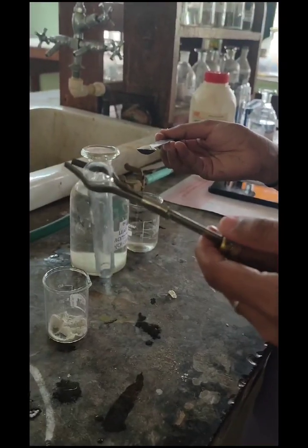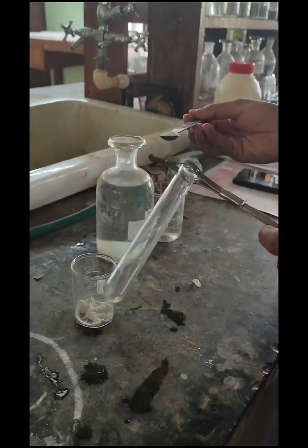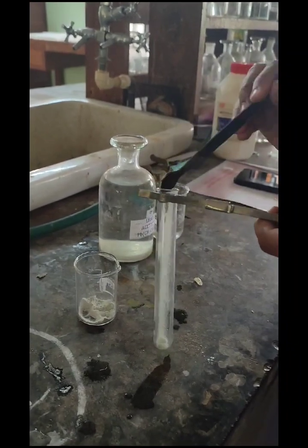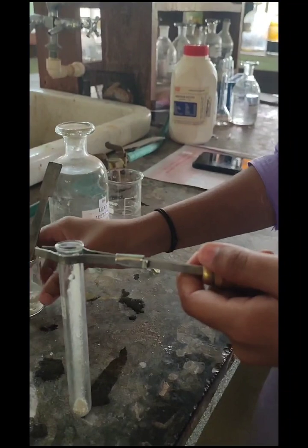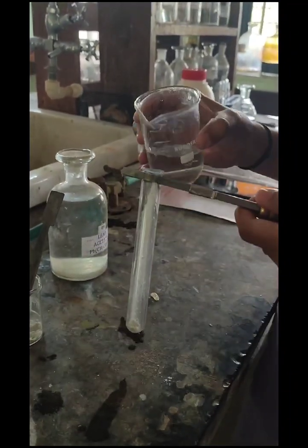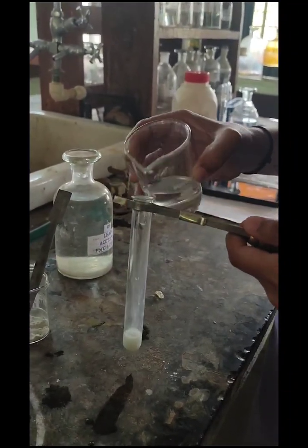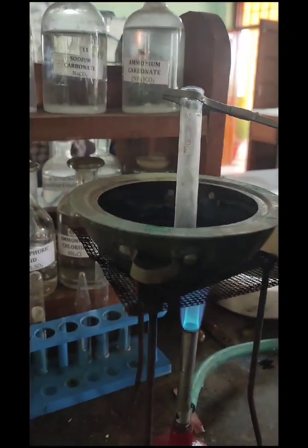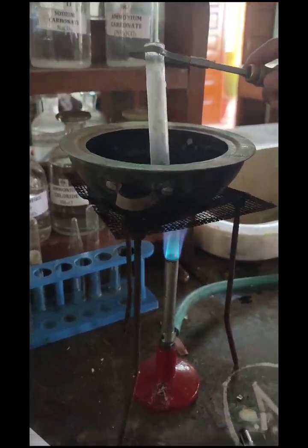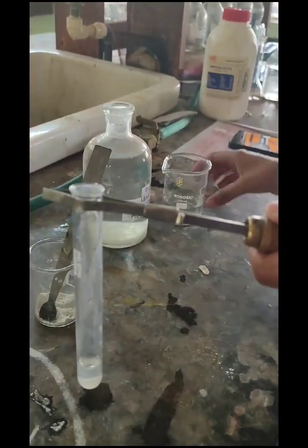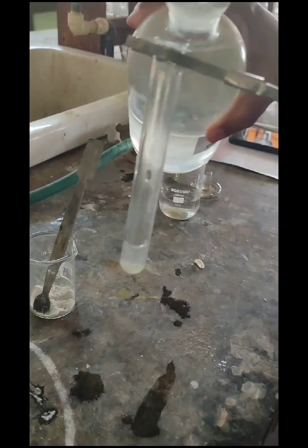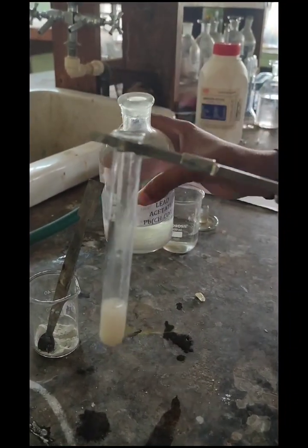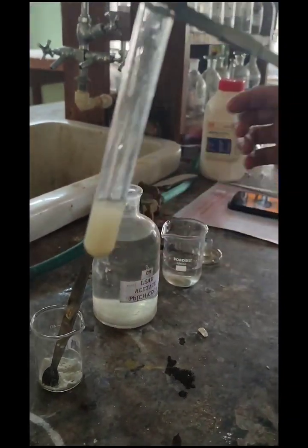For the confirmation test of sulfate, add some amount of mixture in a test tube. To that, add some acetic acid. Heat the solution in a water bath till the CO2 is expelled. Then add 3-4 drops of lead acetate. A white precipitate is formed, indicating the presence of sulfate.